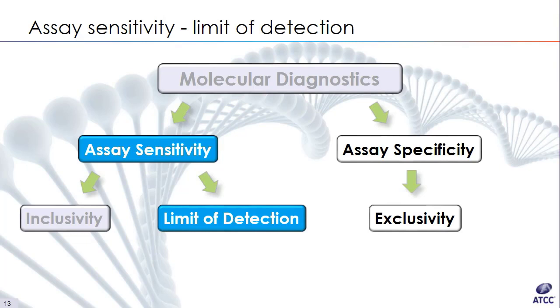And whatever load of the pathogen is detected, it's useful to know that it's there. This is especially true of environmental surveillance assays, like those that test for SARS-CoV-2 in wastewater, because there are epidemiological ramifications to finding even trace amounts of viral RNA.